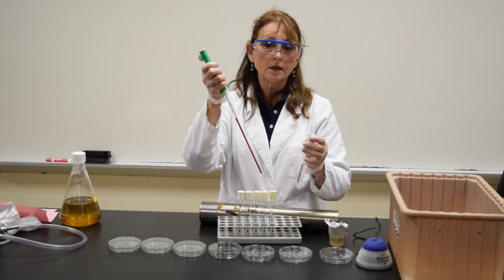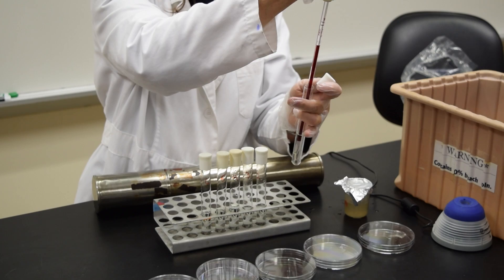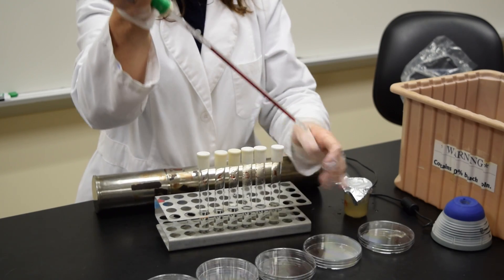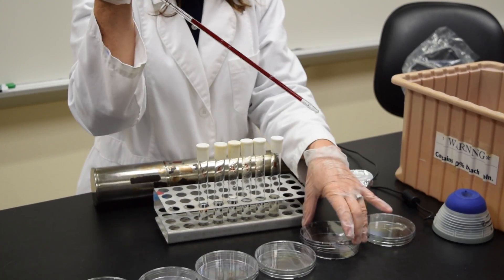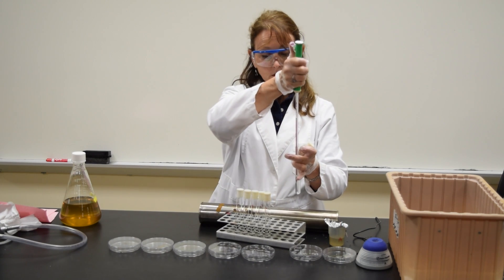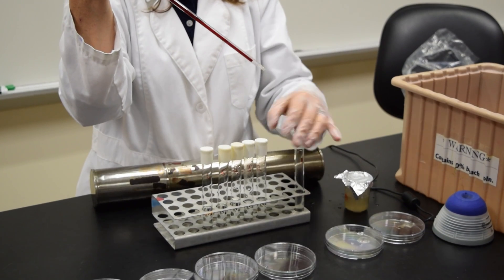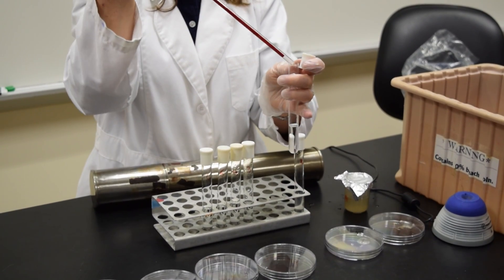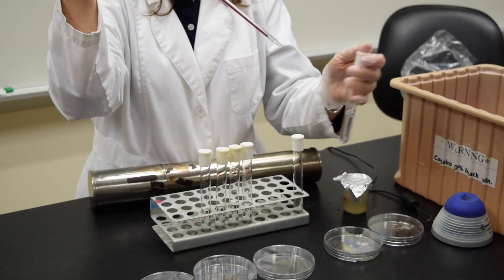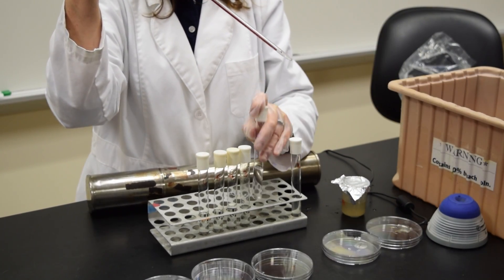I'm going to be working with the 10 to the minus 1 dilution. Draw up to 1 ml and place it in the plate labeled 10 to the negative 1. Using the same pipette, draw another 1 ml from the minus 1 tube and add it to the minus 2 tube. Vortex the minus 2 dilution.